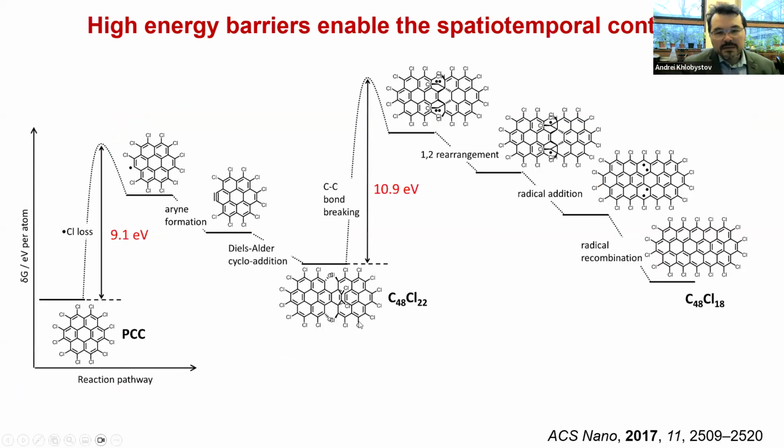I must say that this is the first time when not only we are looking at the process or reaction or chemical bond, which is already known before we started doing microscopy. This is the first example of a chemical reaction discovered by electron microscopy. And actually it's a very important product. Graphene nanoribbons are very useful and popular nowadays.